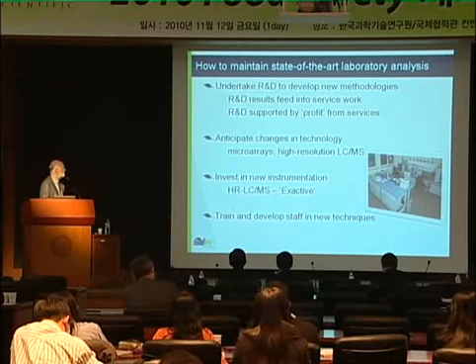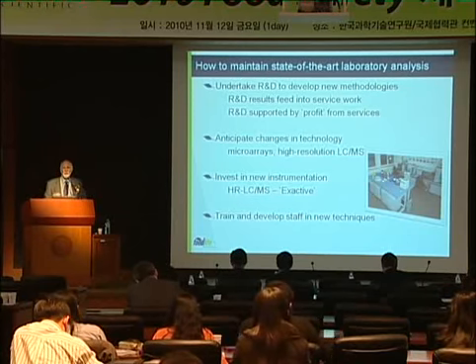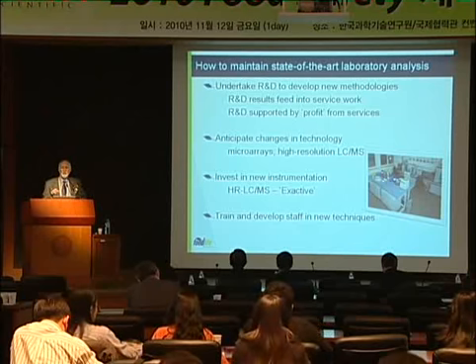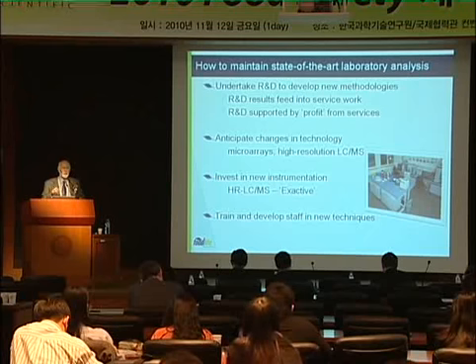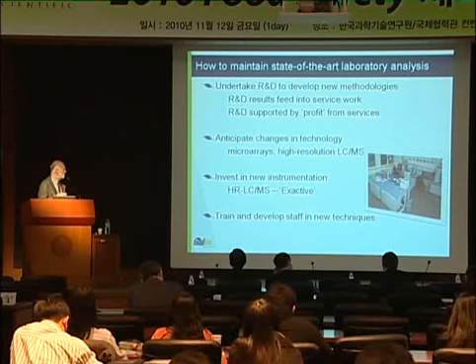So when is the right time to invest in new instrumentation? We talked today about high-resolution LCMS. I believe this is a step change in terms of LCMS, and there comes a point in which successful labs make this sort of investment. You get left behind if you don't do it at the right time. So making these decisions is very critical in terms of success.